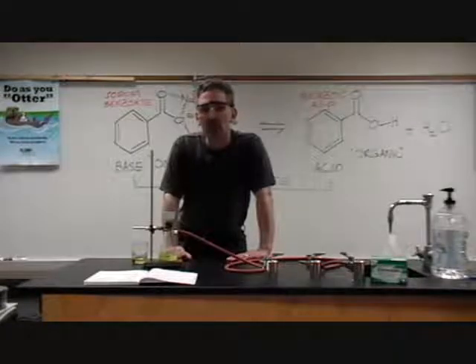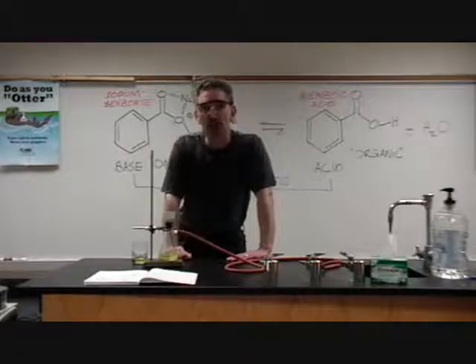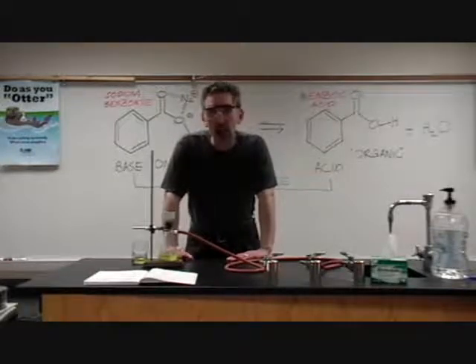Take the sample out of the oven after 5 minutes and recheck the mass of your sample. Once you get 2 measurements which match and show no loss of water, then your sample is completely dry. And don't forget that the benzoic acid can sublime above 90 degrees Celsius, so make sure the temperature of the oven is below 90. 80 or 85 degrees Celsius should be fine.